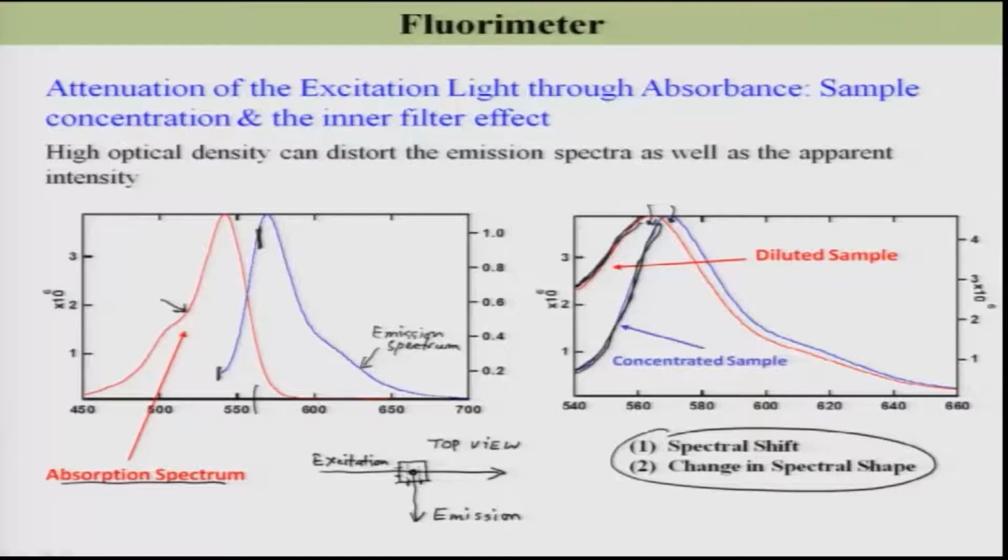So, we need to be cautious while measuring this emission spectra. Measurement of emission spectrum is not trivial, it is difficult, I can tell you. It is not like absorbance. Absorbance is fine because it is just a ratio I0 by I, take a log, plot it versus wavelength, but in this case it is not like that. So, you need to really take care of different aspects.